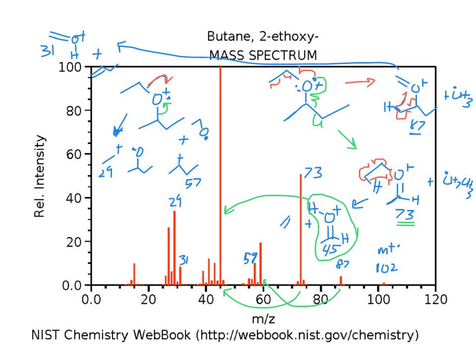Yeah, well, what I would usually do is start with a molecular ion. Hopefully, along with maybe information from NMR or IR, we can get a molecular formula. And then I would start by looking at what losses we see that are common. If we see a loss of 15 or loss of 29, those are easy losses to interpret, right? Loss of methyls or ethyls, things like that.